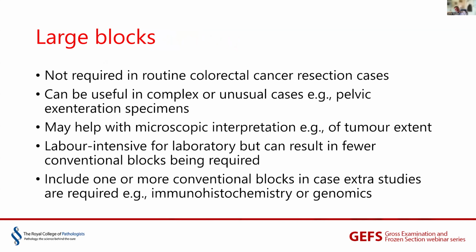Now, I don't know how many of you in your hospitals have access to large blocks and therefore large slides. We don't recommend them for use in routine colorectal cancer resections.